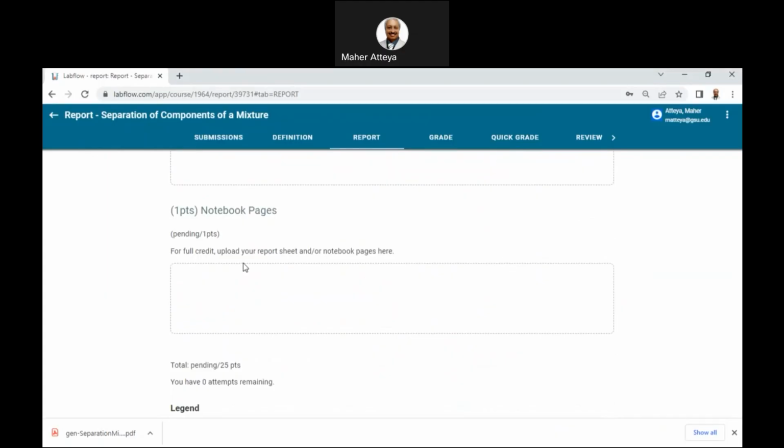So in your lab report, you have to have 5 components: introduction, procedure, data and results, based on your obtained data from Labflow, and then discuss your data. So your recovery is good, your data are good, so you are set to have a very good lab report. And then the conclusion, where you go back to the objective and goals of the experiment.